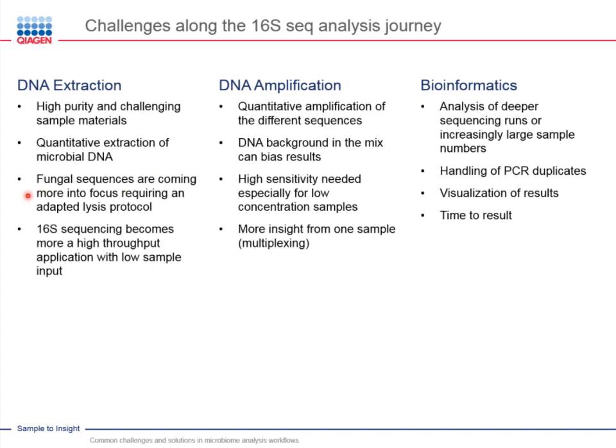As said, fungal sequences are getting more and more into focus. 16S was the start, but now research is more and more interested also in what happens with the fungal microbiome. This means your lysis protocol or your kit needs to be capable of extracting not only bacterial DNA, but also fungal DNA.